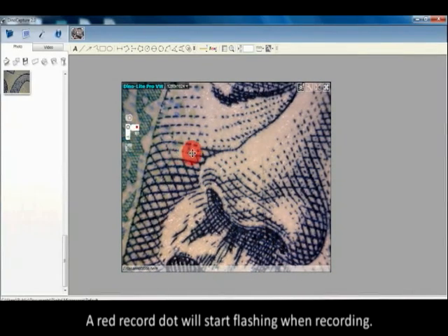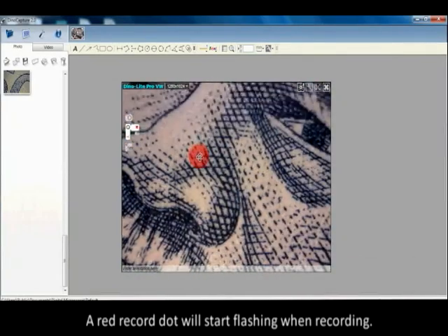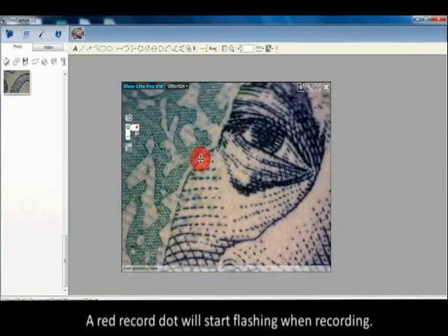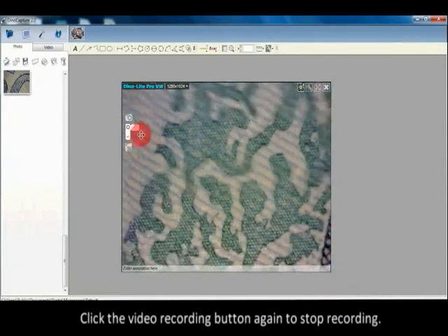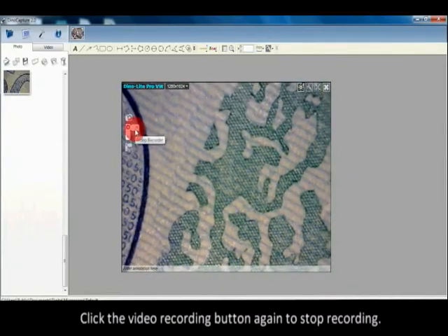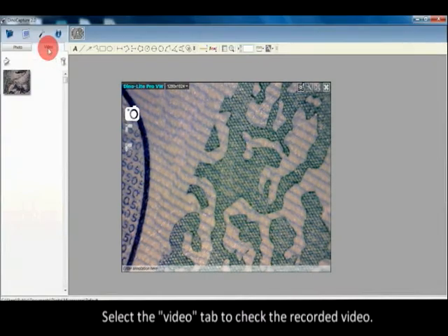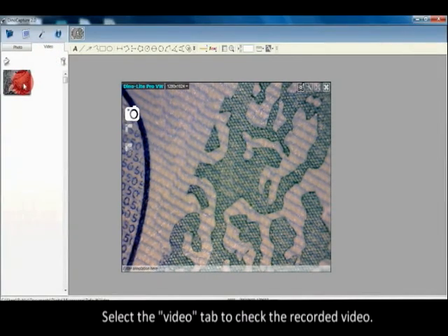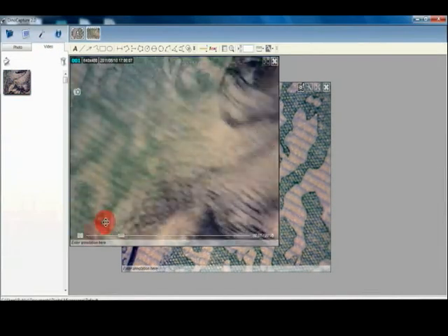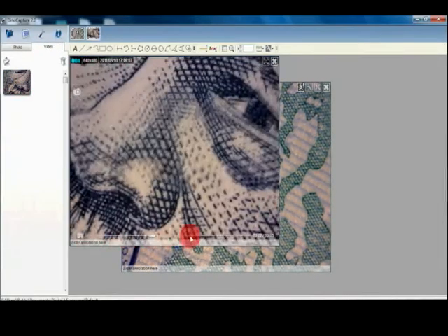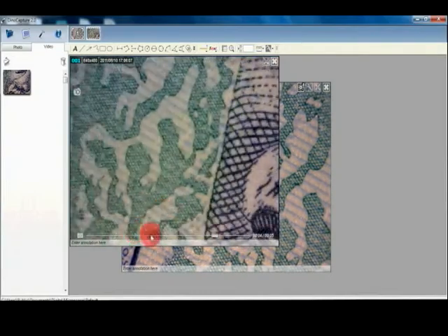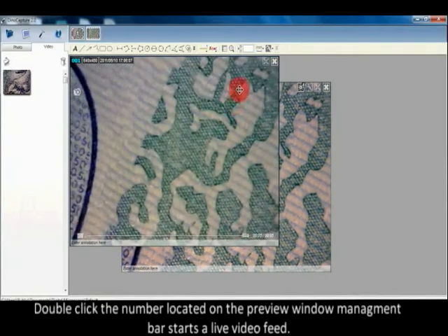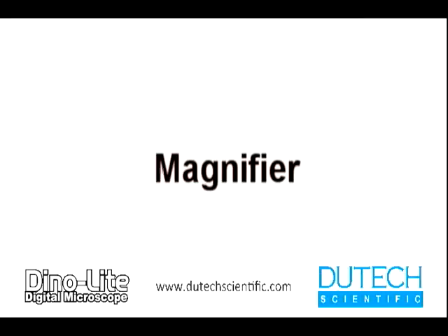Click the handy cam icon to start a video. A red record dot will start flashing when recording. Click the video recording button again to stop recording. Select the video tab to check the recorded video. Double-click the number located on the preview window management bar to start a live video feed.